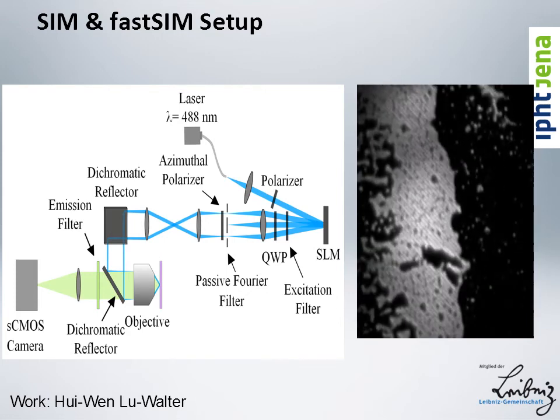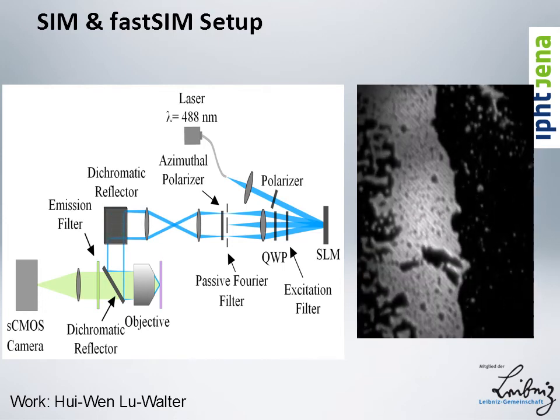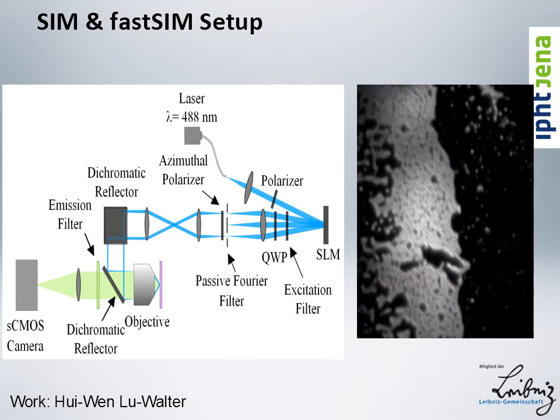then the interference is gone. One trick that we used to prevent the orientation of the polarization from being messed up is these dichromatic reflectors here and here, which are oriented perpendicular in such a way that what was S polarization and might get delayed by the reflection on the dichromatic reflector then becomes P polarization on the second one. And since they are identical, they basically cancel each other out in their delay, and therefore the polarization is again perfect after these two dichroics. Okay.